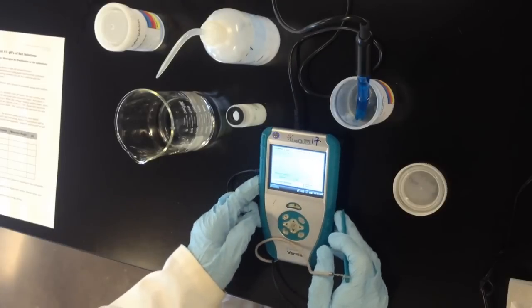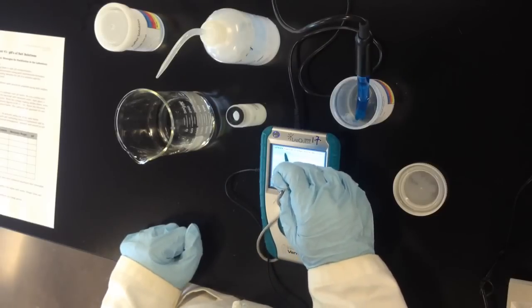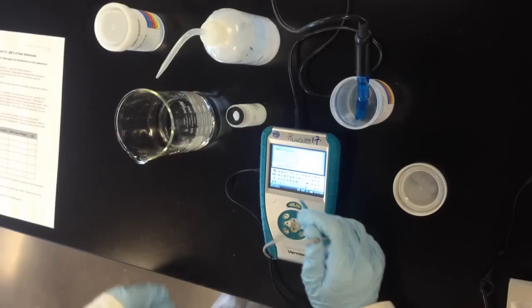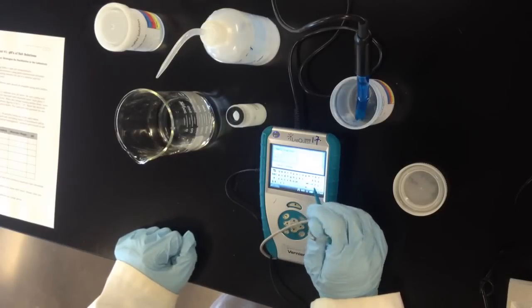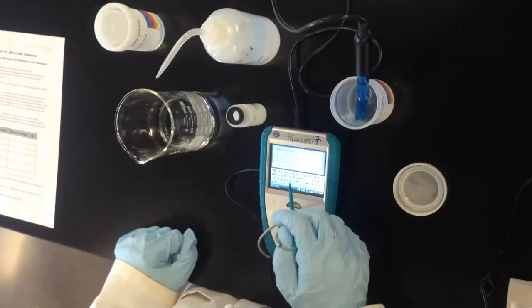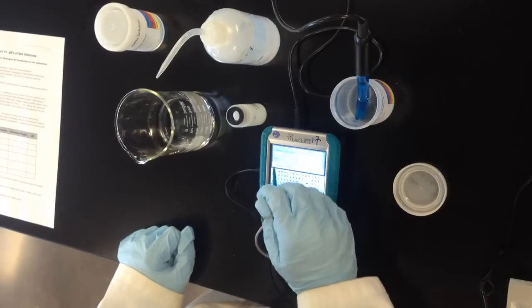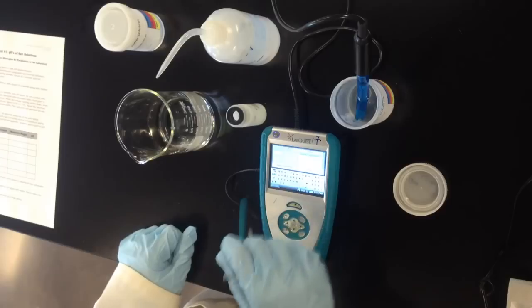This will bring me to a screen on the LabQuest where I can enter the known or the true values. The beauty of this approach is that we know the pH of the buffer. It maintains a pH of 4.00. So after giving some time for that electrode to settle, we can type 4.00 here for the true value and then you may need to scroll down using the scroll bar on the right hand side but there's a button below that text field that says keep.